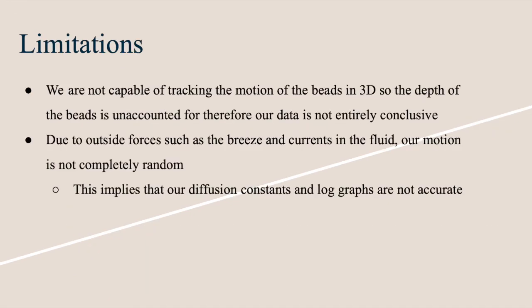Some of the limitations of our experiment include the inability to track the motion of the bead in 3D, so the depth of the bead is unaccounted for, and our data is not entirely conclusive. Also, due to outside forces such as breeze and currents in the fluid, our motion is not completely random. This implies that our diffusion constants and log graphs are not accurate.